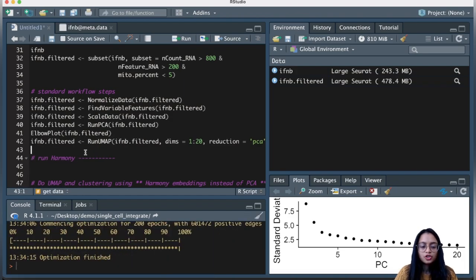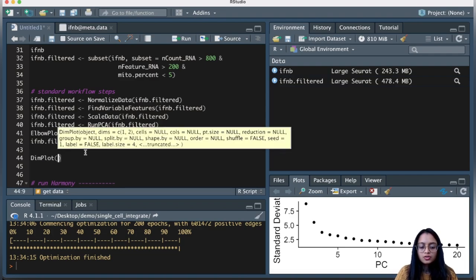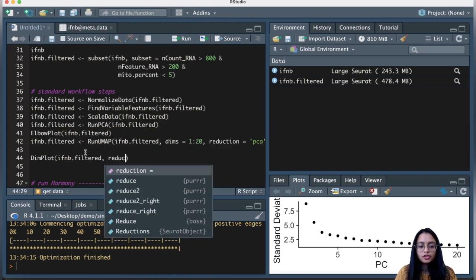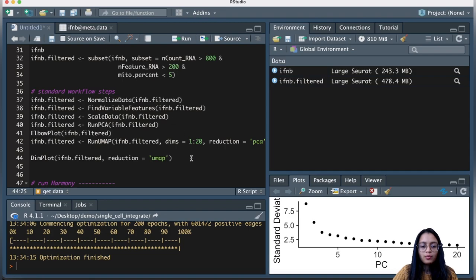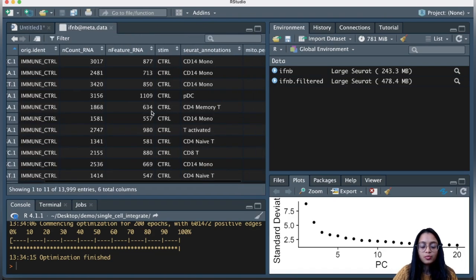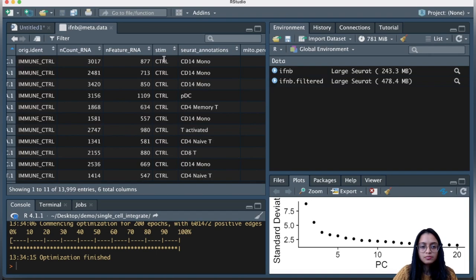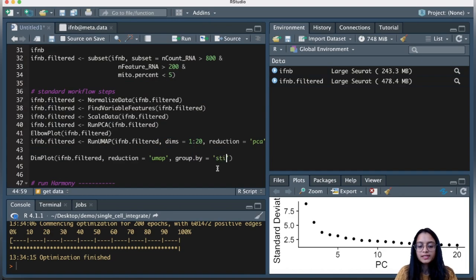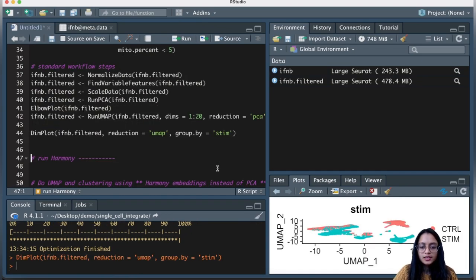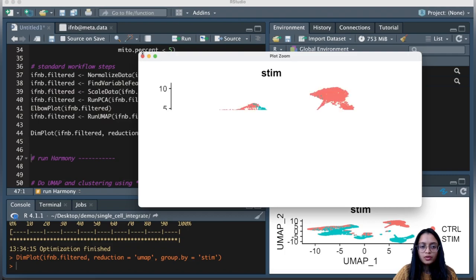Now that UMAP has finished running, let's create a dimension plot using the filtered object. The reduction used is UMAP, and I want to group by condition. Looking at the metadata, the 'stim' column holds the condition information, so I'll use that column to group cells. Running this and zooming in on the UMAP, the cells clearly separate by condition.